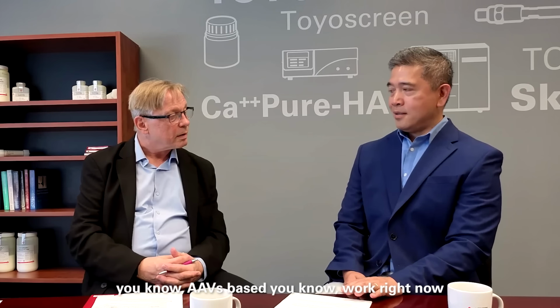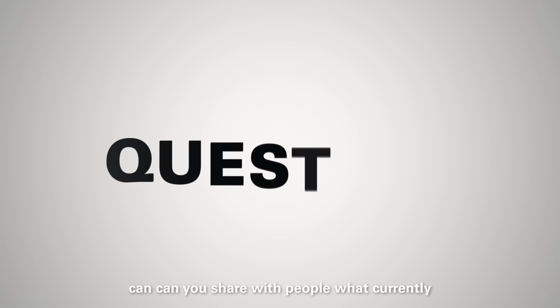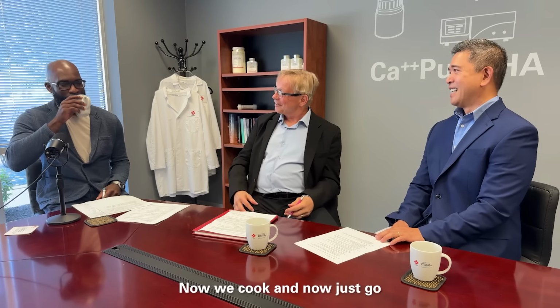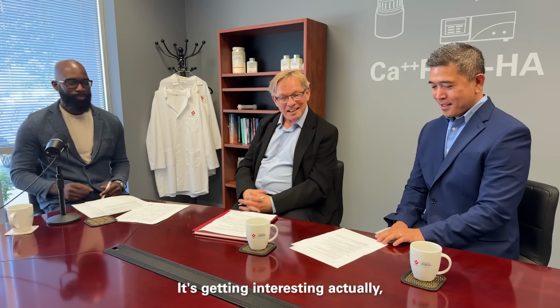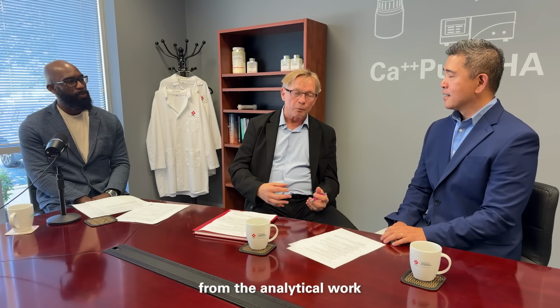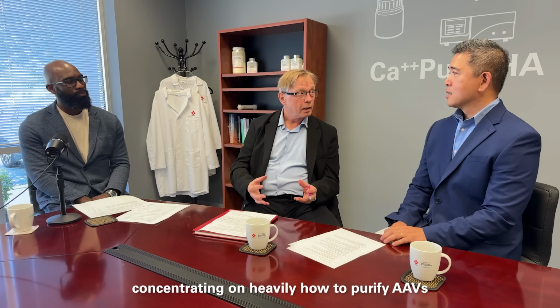Now, Yuka, I actually want you to disclose a little bit. I know that you are heavily involved in AAV-based work right now. Can you share with people what you currently do in the lab, or whether you have a few projects in the lab? Okay, now it's getting interesting, because I'm really revealing something which is not yet even published. Moving on from the analytical work, we have recently been concentrating heavily on how to purify AAVs and how to separate those full capsids from empty capsids.